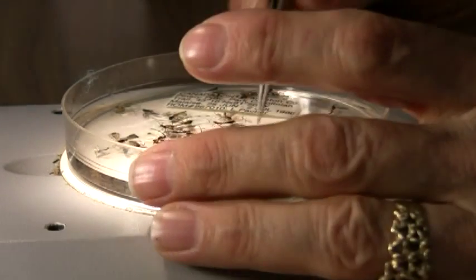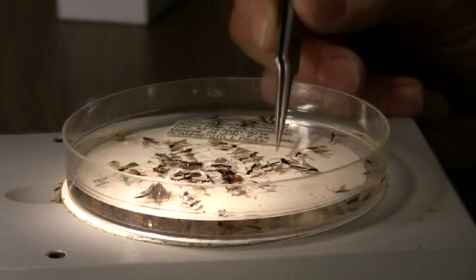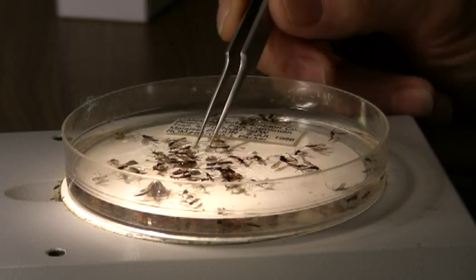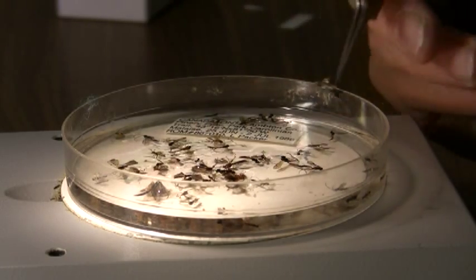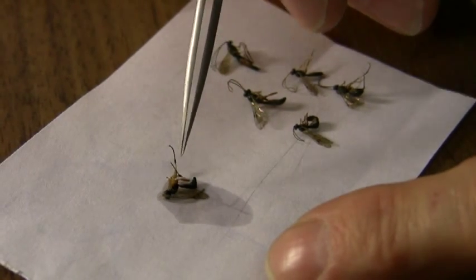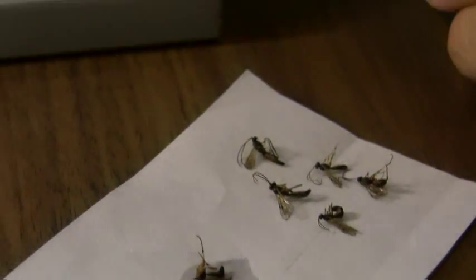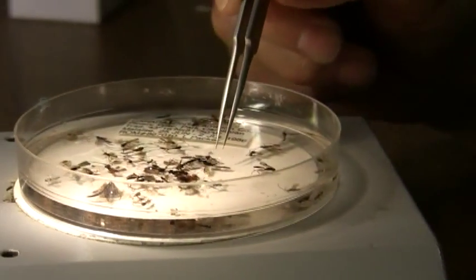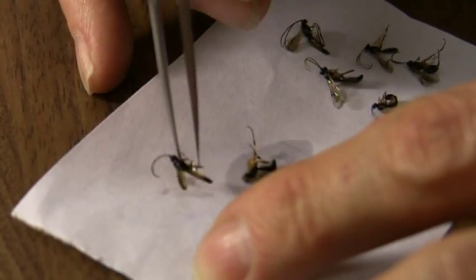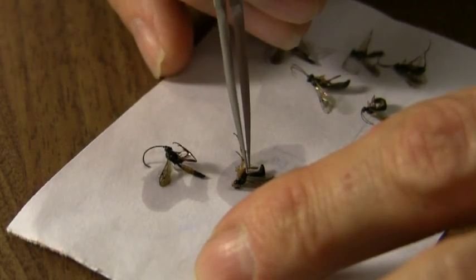First thing we need to do here is simply select the insects for preparation, and it's the same as before. The important thing here, though, is when you select the specimens, to put them on a piece of paper and then try to move them around a little bit while they're still damp and covered with the 95% alcohol. Move them around a bit so the wings lay nice and flat. If you don't do that, they're going to get all crumpled up, and it'll be much more difficult to see what you've got. So again, if you just put them down on the paper and then move them a bit, pulling them along the paper until they appear to be flat, and then let them dry.